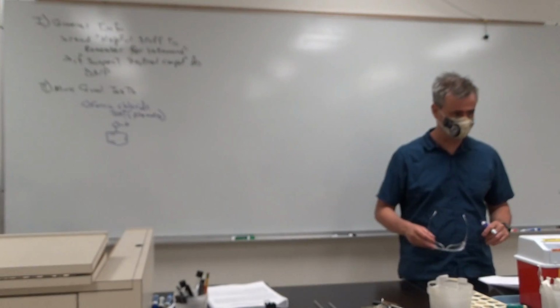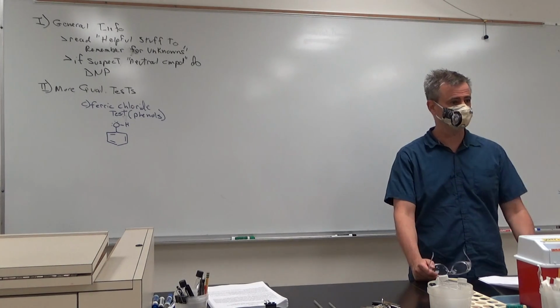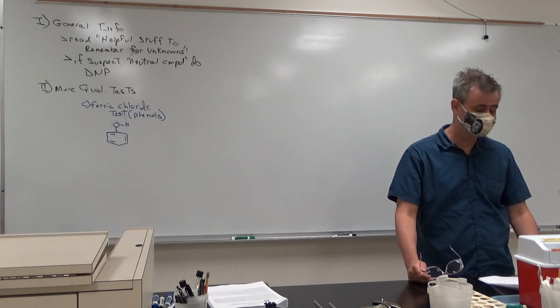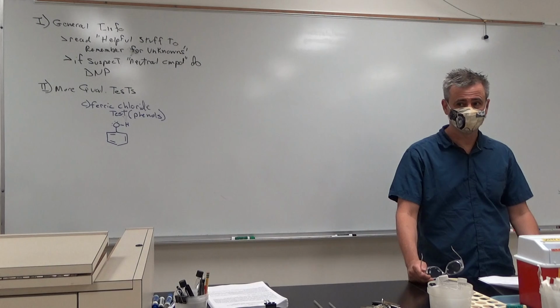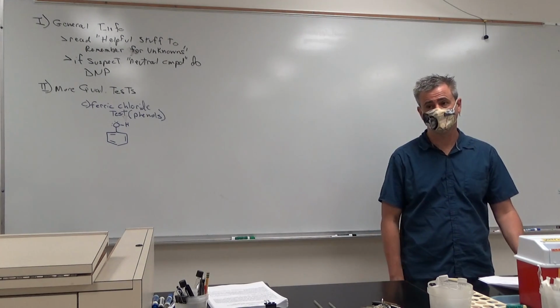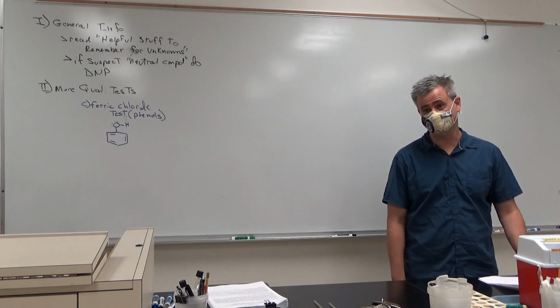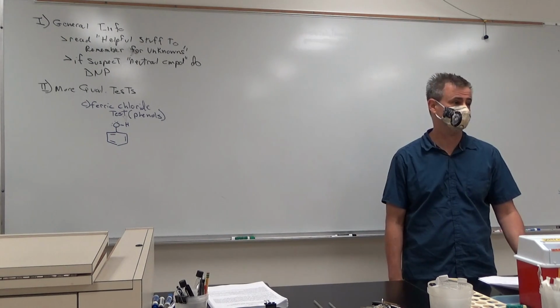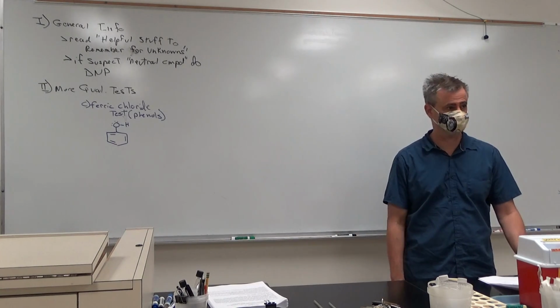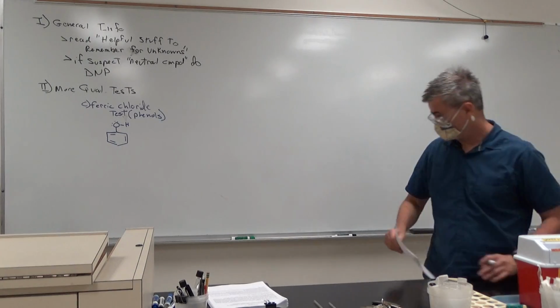Is that right? Does anybody have the thing in front of them? Does anybody have the ferric chloride? On your procedure sheet, it says unknown with H2O. You can also do this test with 70% ethanol. Yeah. So there's a lot of your compounds that aren't very soluble in water. In fact, we would actually predict if you suspect it's a phenol, it's because it wasn't soluble in water. So the 70% ethanol will definitely work and dissolves a lot more than just plain water. Same volume? Yeah. Okay.